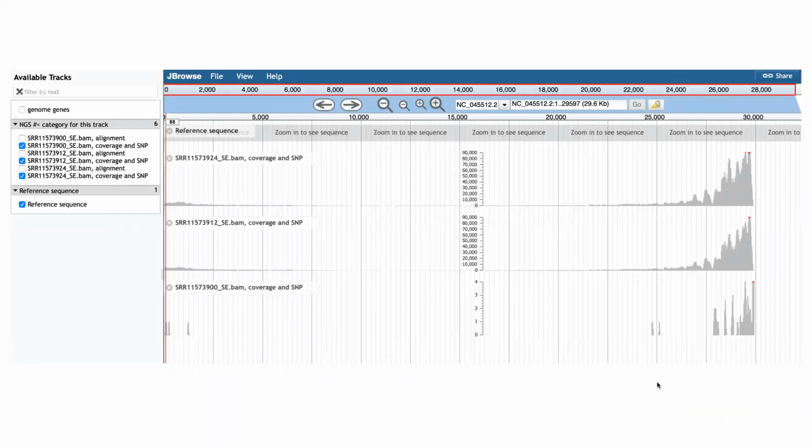All right, so most of you correctly identified that the last one does not have many reads that actually line up to this genome. In fact, it has, I would say, close to 0 reads, apart from that last section, which seems to have a lot more reads in all of them, right? So eventually we'll take a look at what is happening here, why so many reads are actually being mapped there.